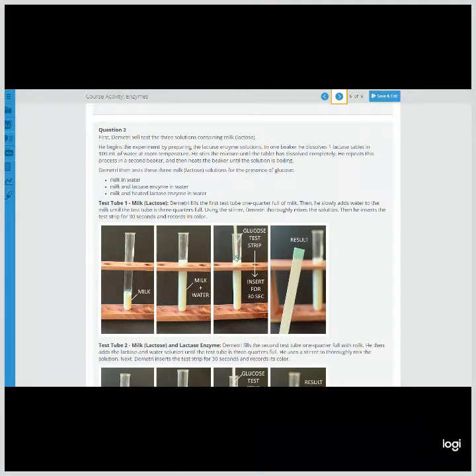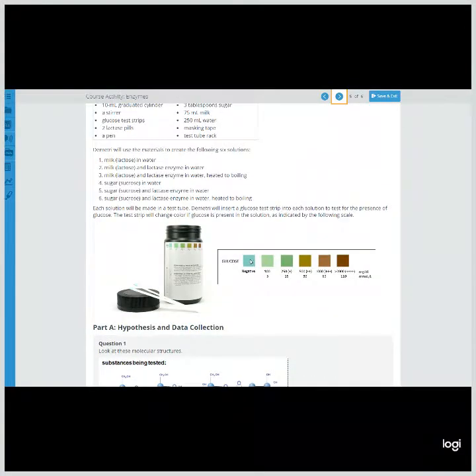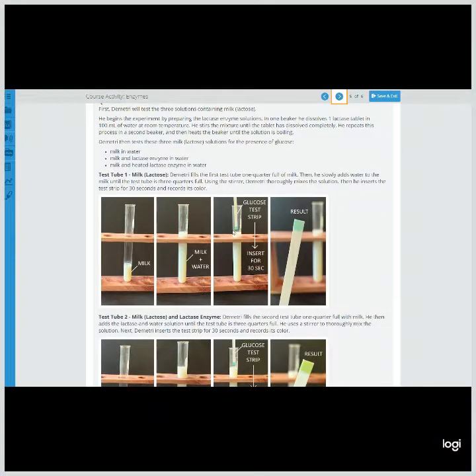So that's the test tube strip. Now look at the color right here, and you're going to compare that color to this as a result. They put the glucose test strip in there for 30 seconds after they've already swirled and mixed it around with the stirrer. And then they pull it out. If you look at it, even though this color does not perfectly match this, you can see that it relatively matches this, pretty much similar, except that it's wet. So in this case, we're going to say that this is negative.